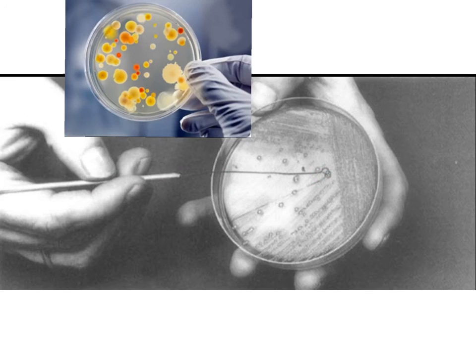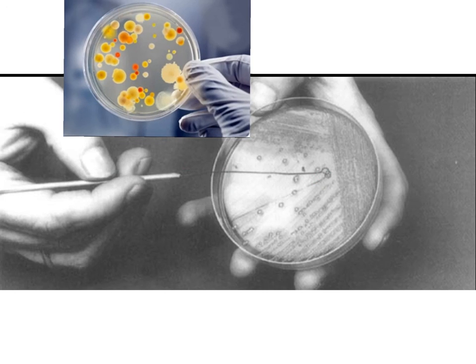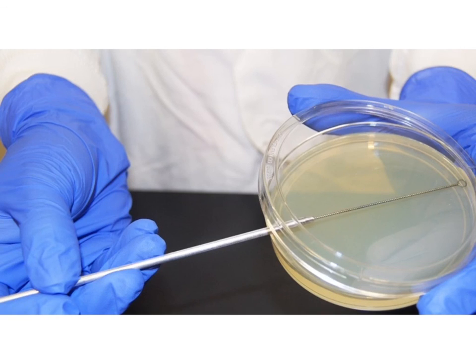What I mean by one individual colony is you would take the flame loop and touch it to one of these colonies. We've scooped up the bacteria, and now we're going to rub it around in a little circle right here on our petri dish. Our petri dish has had the lid on it the entire time. Notice how I'm placing this just underneath the lid and smearing that around, trying to eliminate as much airborne contamination as possible.